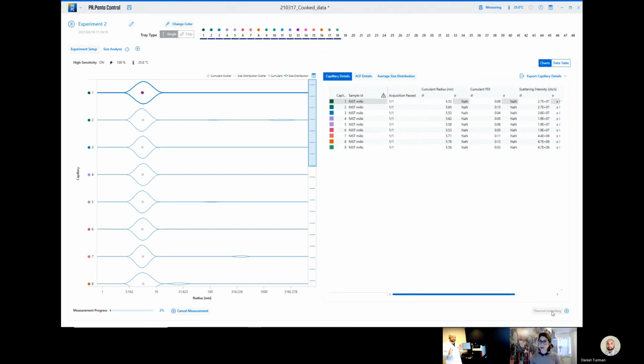So there is a slight shift because of the location of the optics and the DLS measurement acquisition and the thermal nano-DSF and back reflection that's reflected in the software. If you look closely, you'll see the points are offset just a little. And that's only because we know the temperature of the capillaries exquisitely close, around 0.1 degrees Celsius. So we can actually calculate exactly what that temperature shift would be. Great, thank you. The two optics.